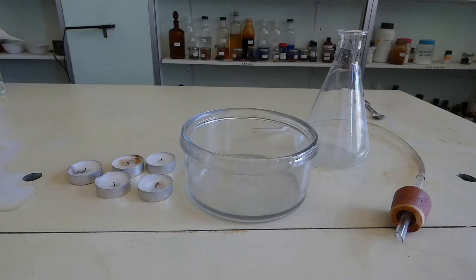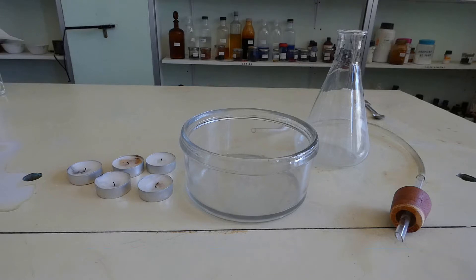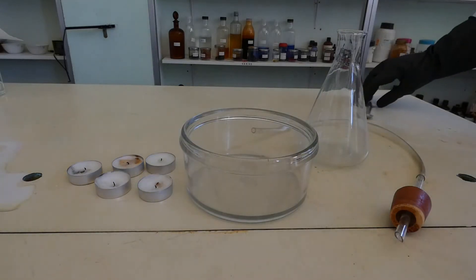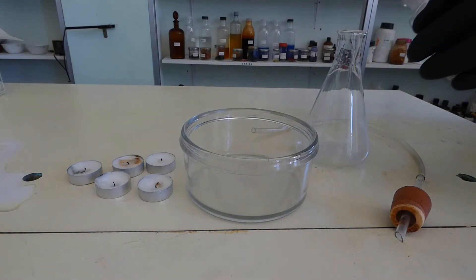Let's make a laboratory fire extinguisher. First, add a few tablespoons of sodium hydrogen carbonate in an Erlenmeyer flask.